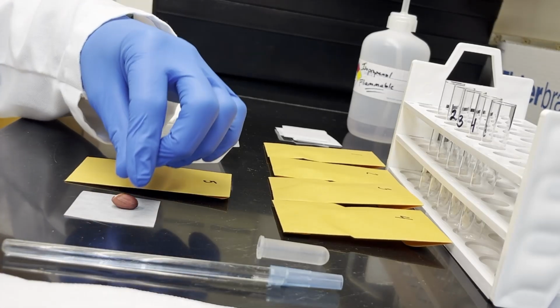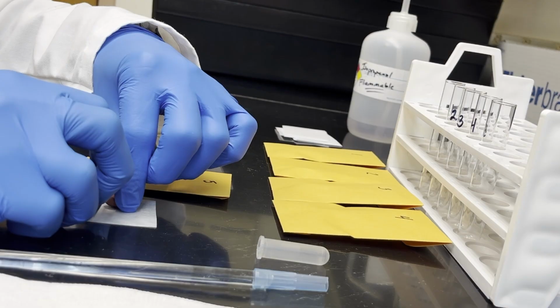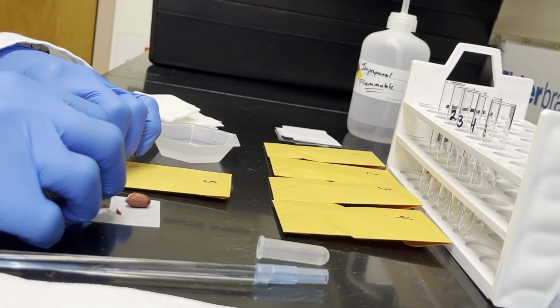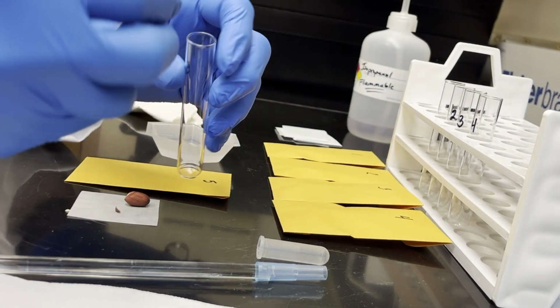To sample the seed tissue, a small amount is cut from the distal end away from the embryo. In this way, the seed remains viable in case germination is required later. Only a small amount is needed, about 50 milligrams or so.